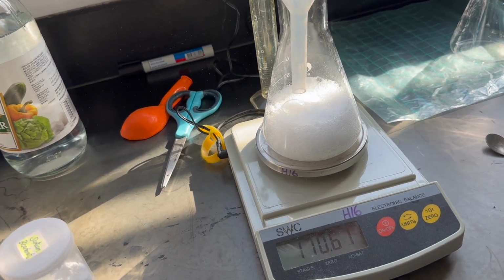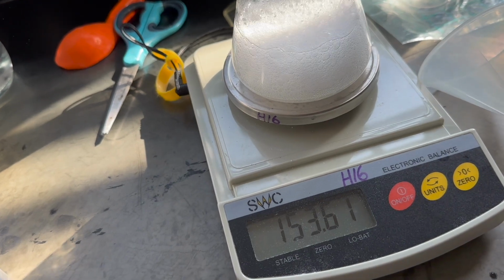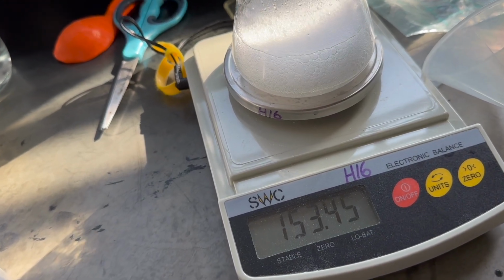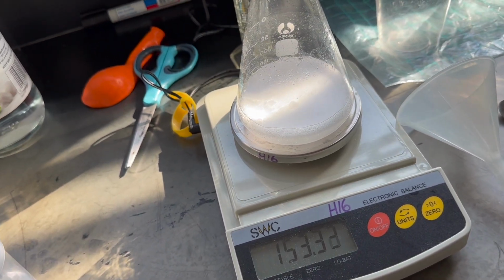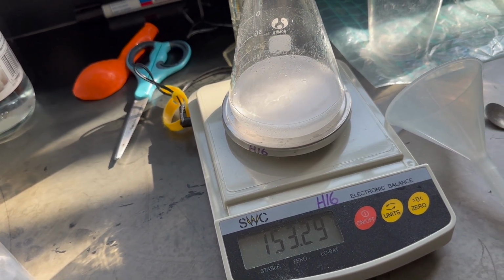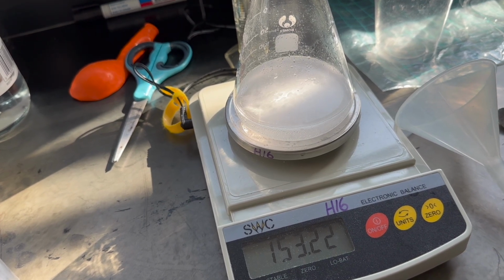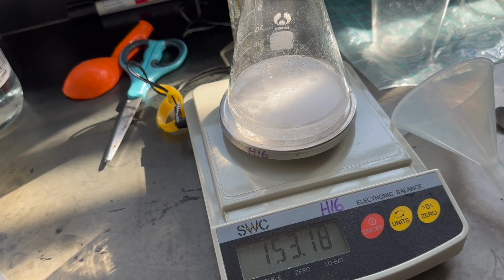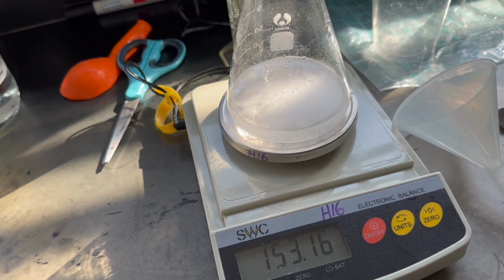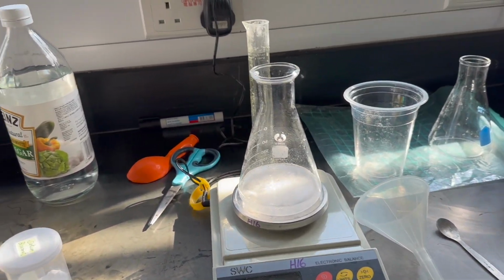So, yep, mass went up. Now I'm going to take the funnel off and watch the mass on the scale. See, it's decreasing, still decreasing as the reaction runs. 0.22, 21, 20, 0.19, 18, still decreasing. So why would it be decreasing?